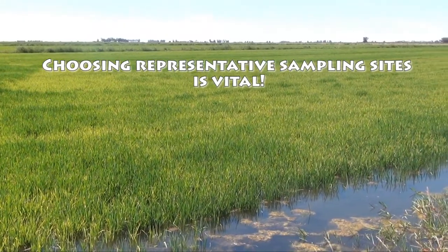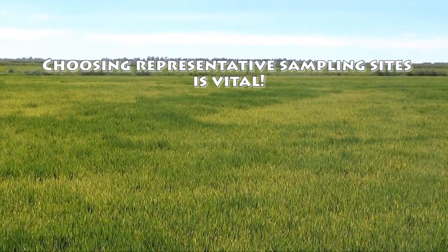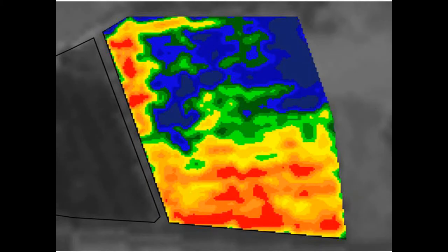Taking representative samples is vital. Steer clear of headlands and banks. Record the sample location on your paperwork. Remote sensing imagery can be helpful to decide on the sampling points.